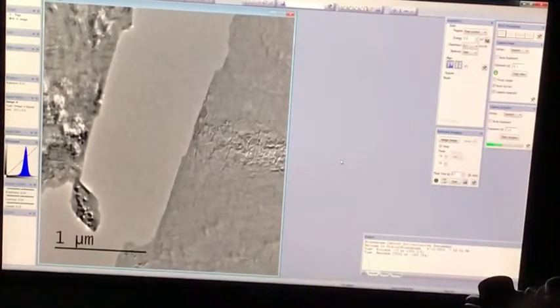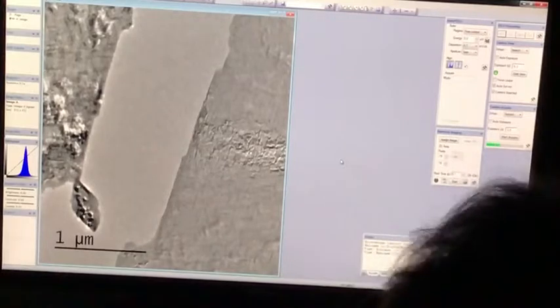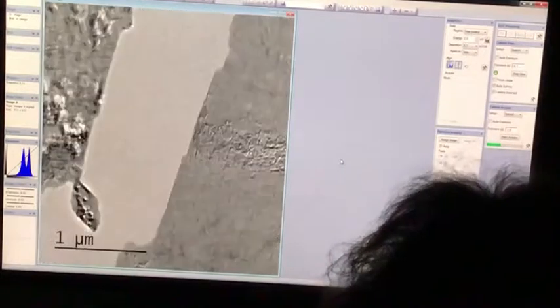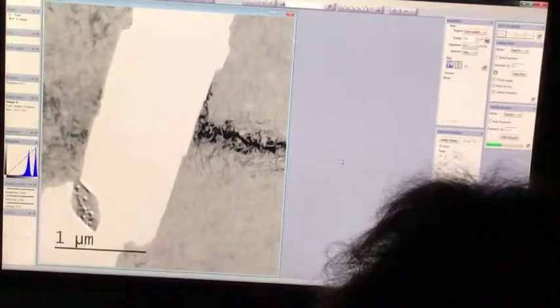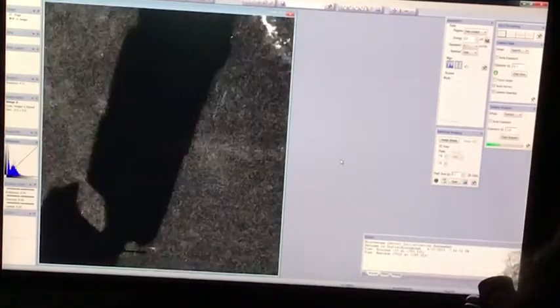And now, what I can do to accentuate that is to put an objective aperture in. So I'm just putting an objective aperture in without looking at the diffraction pattern, because it's going to come in hopefully on the central beam. That doesn't change things that much, but there the contrast changes quite a bit. And if I go even, okay, that's becoming a dark field image. So I'm moving the objective aperture around significantly, and you can see things flash on and off as different beams come in and out of the objective aperture.